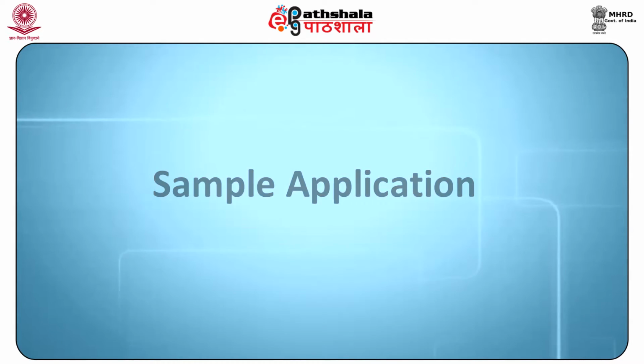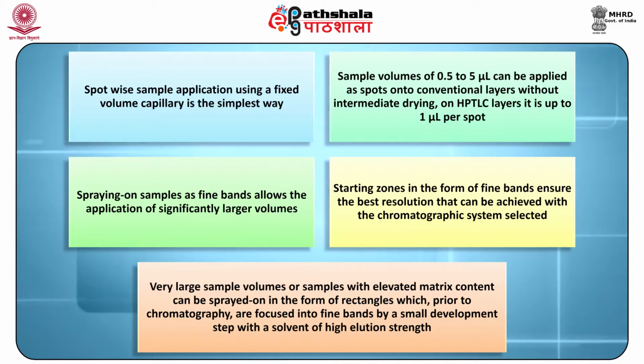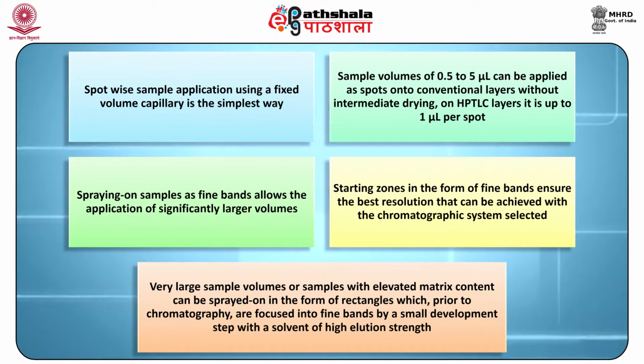Sample application. Sample application is the first step in the workflow of planar chromatography, and it considerably affects the quality of the results at the end of the process. Spot-wise sample application using a fixed volume capillary is the simplest way. Sample volumes of 0.5 to 5 microliters can be applied as spots onto conventional layers without intermediate drying. On HPTLC layers, it is up to 1 microliter per spot.